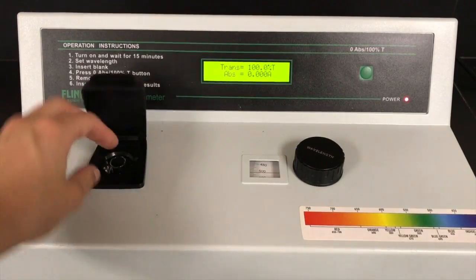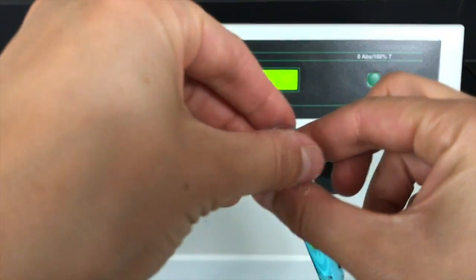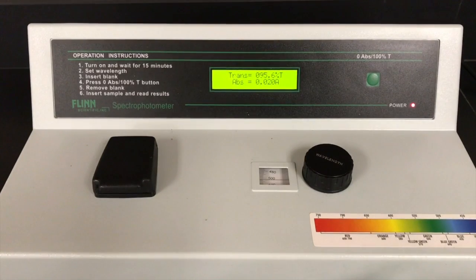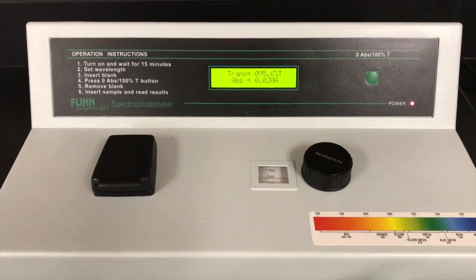Okay, now I can use the sample. So I'm going to pull this one out. Now I'm going to put one of my samples. You're going to do a total of 5 of these. Okay, and so I get an absorbance, which is what I'm going to measure, of 0.02.